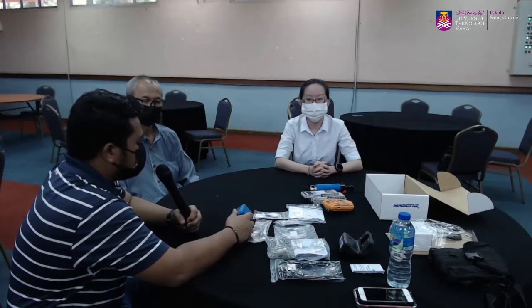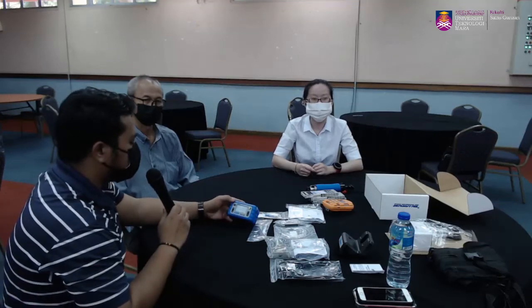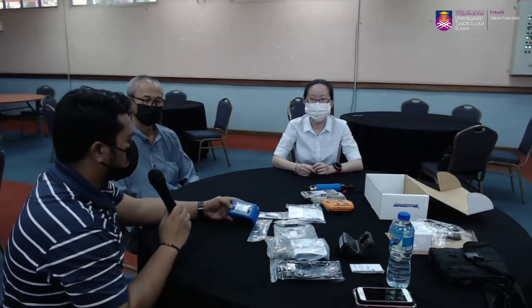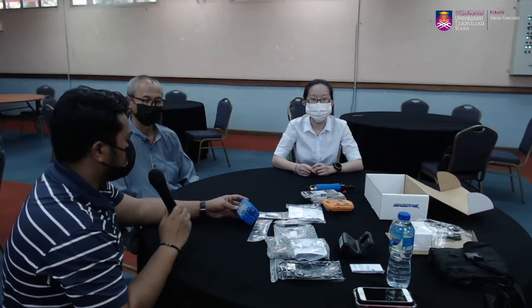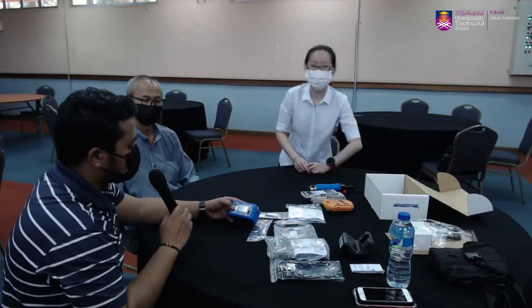So air sampling pump ni is the latest model which is sekarang dia ada digital punya screen. Okay. So daripada digital punya screen ni kita usually-nya boleh set upkan kita punya peralatan ni in terms of berapa flow rate. So daripada sini kita just boleh scroll through kita punya settings. It's either kita nak terus run.